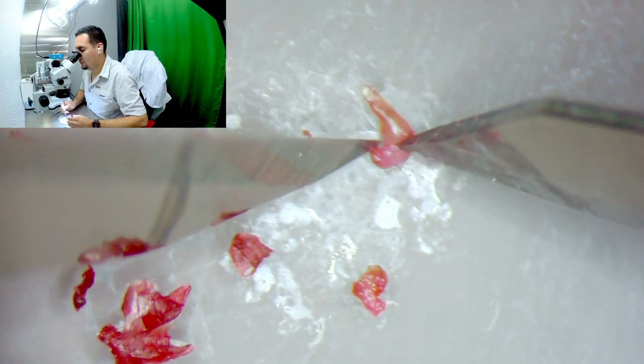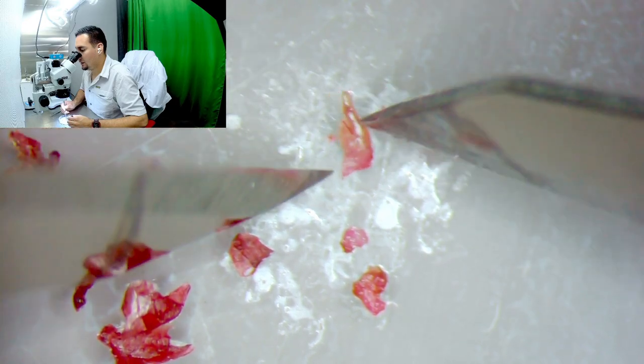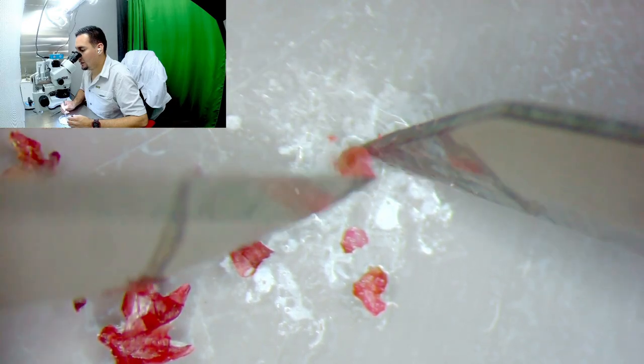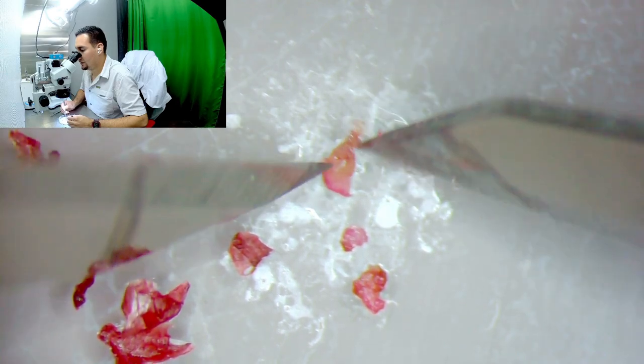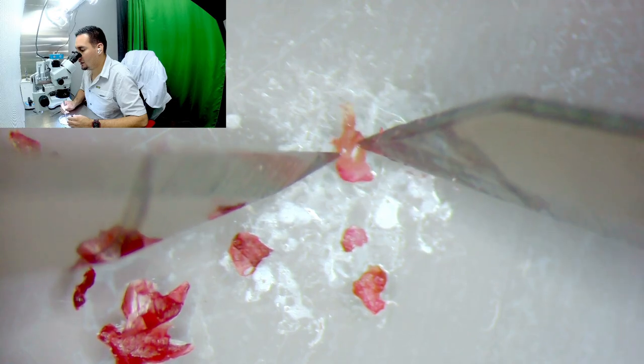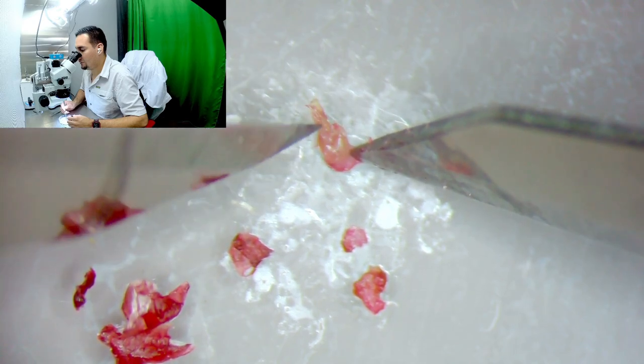Even if the outside may have been contaminated or not completely properly sterilized, the inside — this shoot tip — has a very high chance of being sterile or very clean. But I want to keep going. If you want to do shoot tips, this is good enough, but let's see how far I can get. I can tell I'm very shaky today, so I may not be able to get all the way to the meristem.